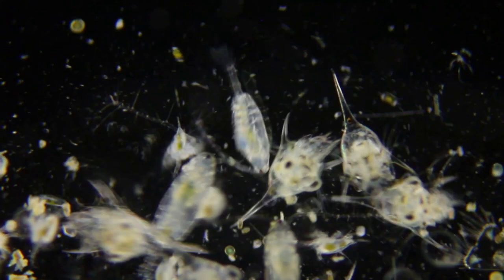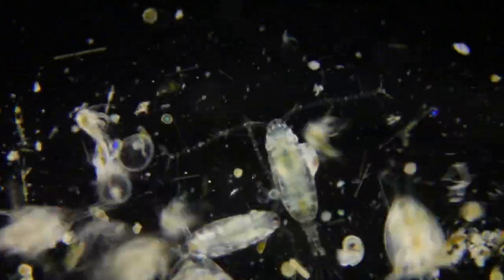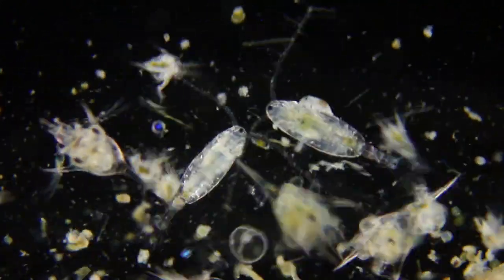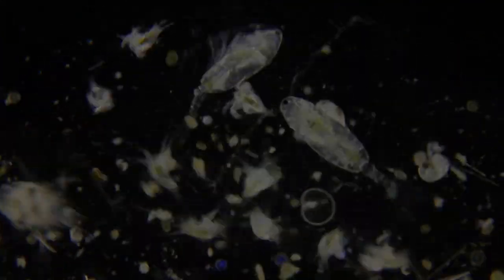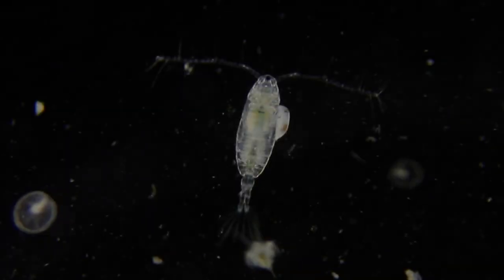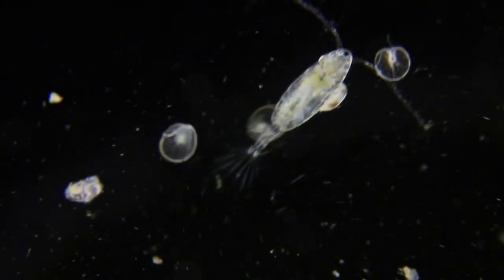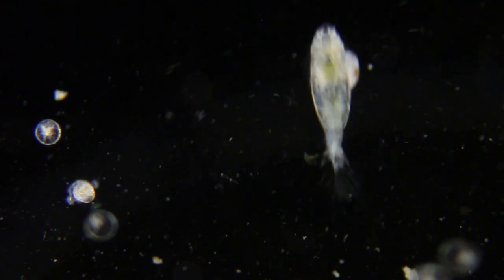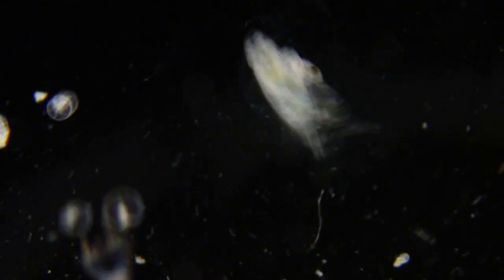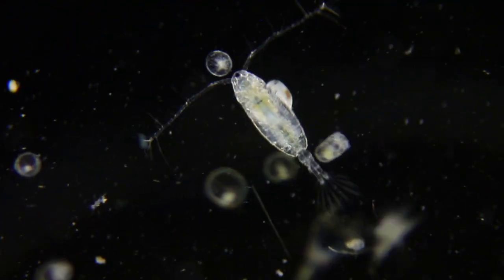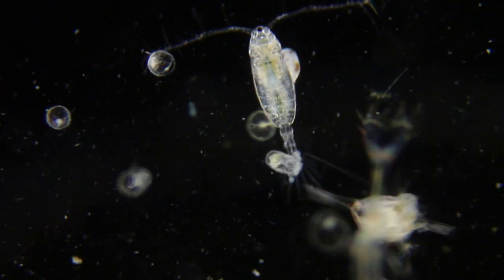Several of the calanoid copepods in this week's review have a hitchhiker attached to their side. A large parasite for such a small organism. They are the Microniscus larvae of a parasitic isopod. These epicaridians use two different crustacean hosts to complete their life cycle.